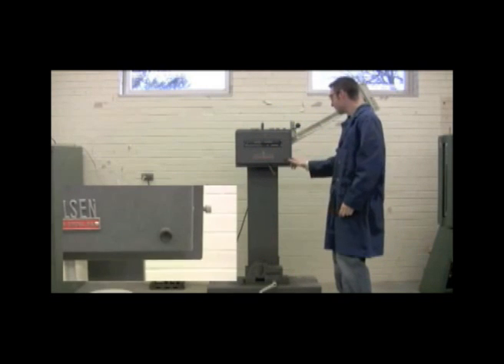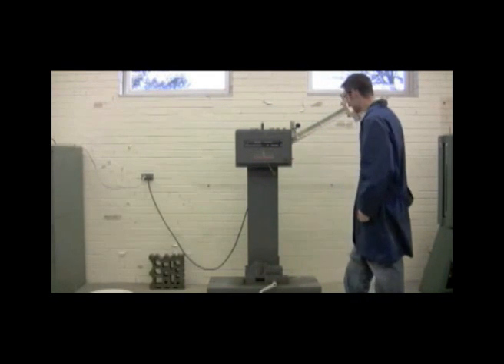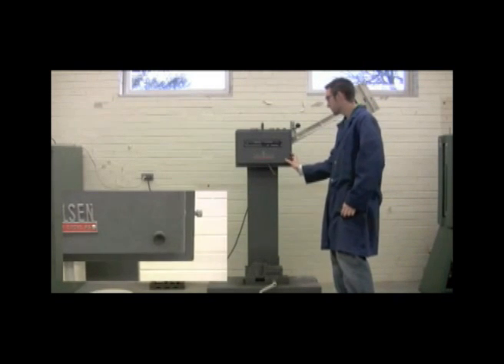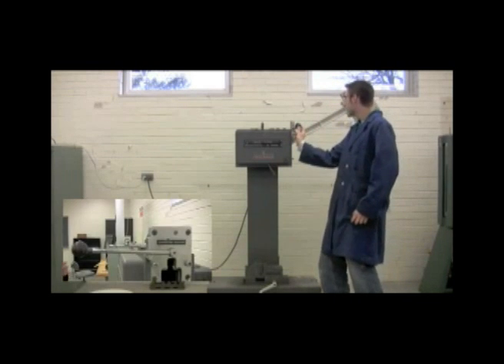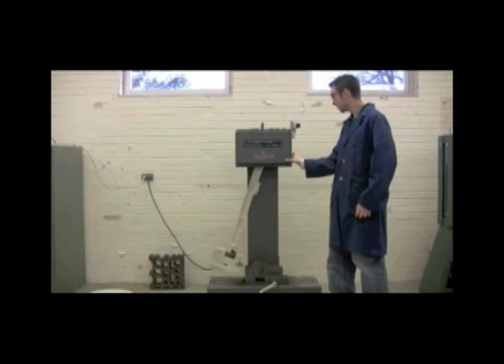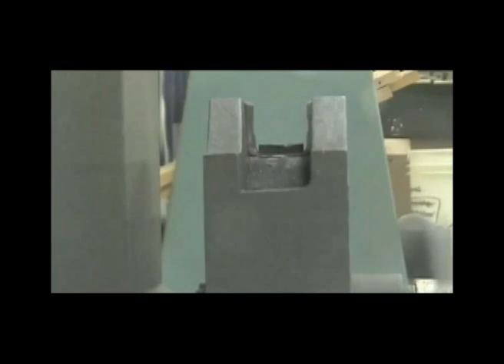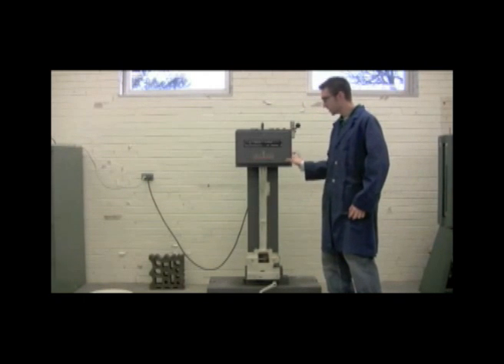Before I do anything, I want to tell you about our brake. When the hammer is going, you're going to want to hit this brake to slow everything down after testing. So we're going to release our latch and hit our brake.